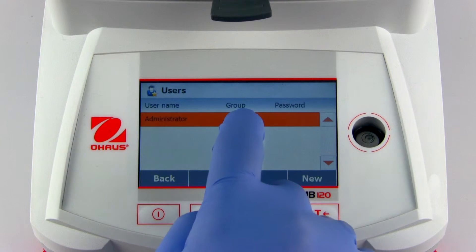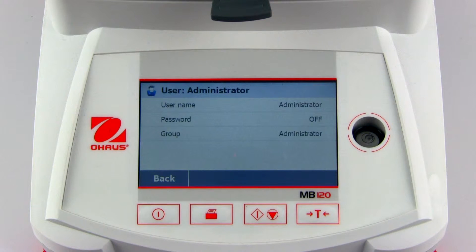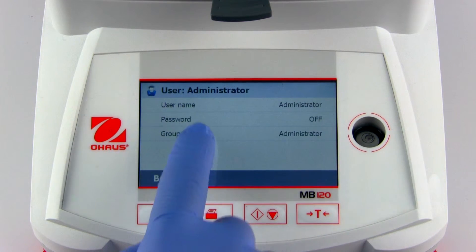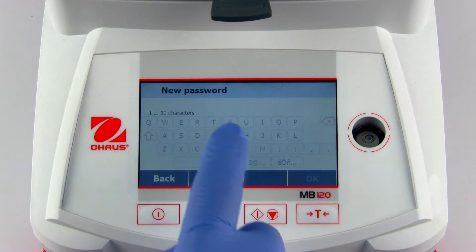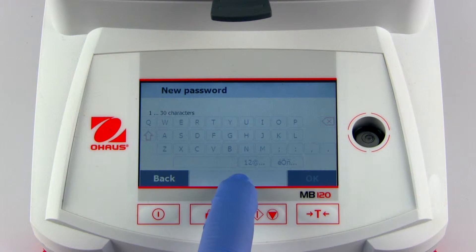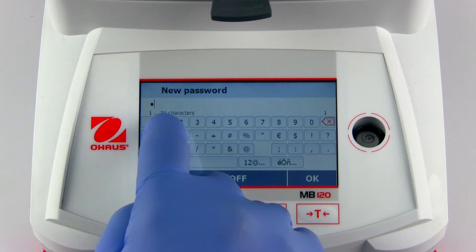The first step will be to protect the administrator account by assigning a password. To assign a password, press password, enable it, and enter a new password.